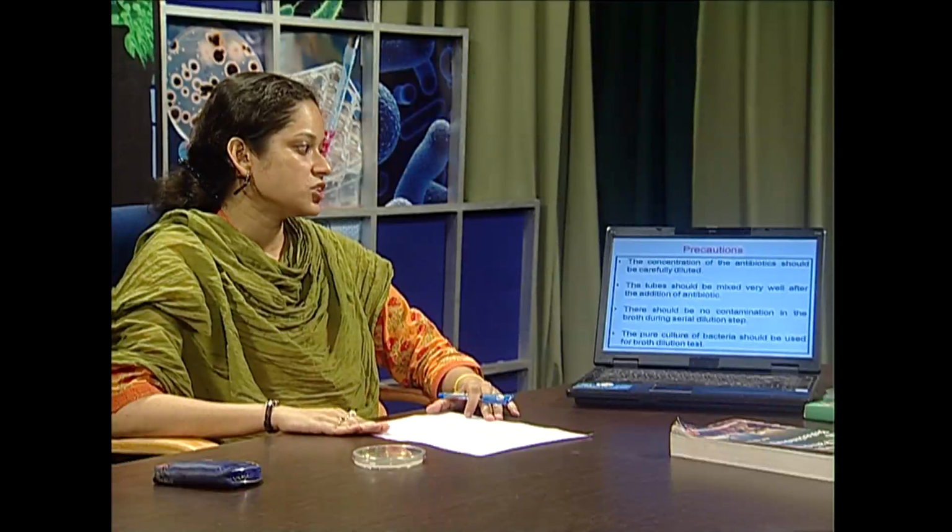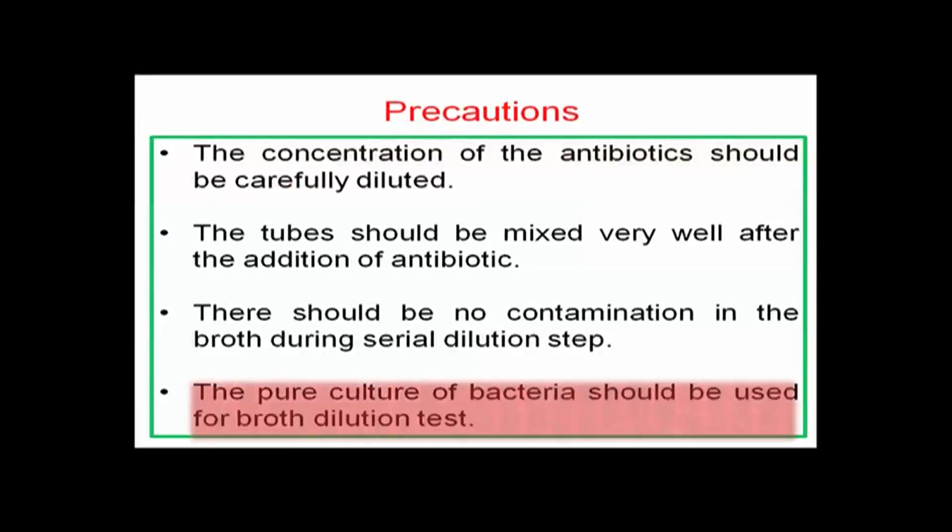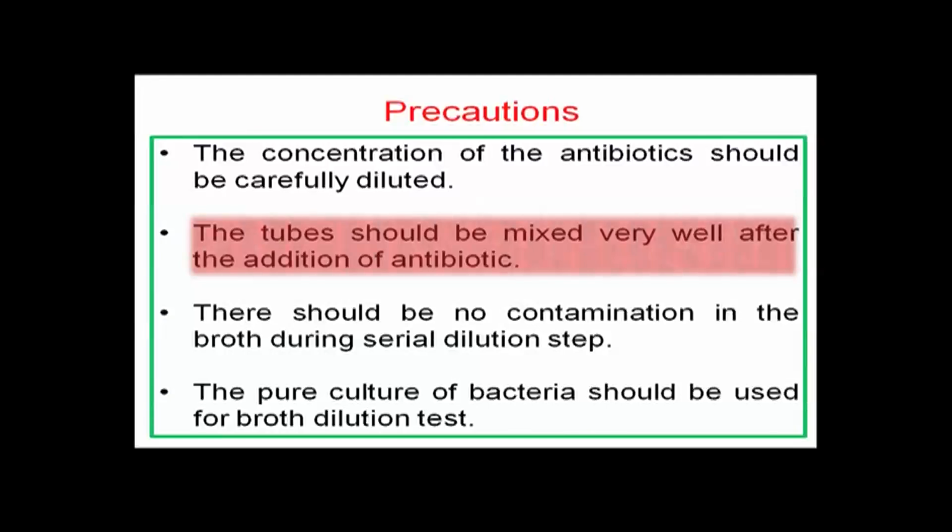First, the concentration of the antibiotics should be carefully diluted. The culture which we use for MIC should be a pure culture, and there should be no mistake in the serial dilution step. And after the addition of antibiotic and your culture, it should be mixed well.